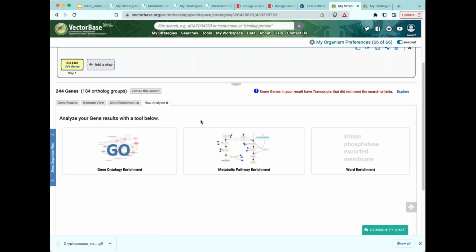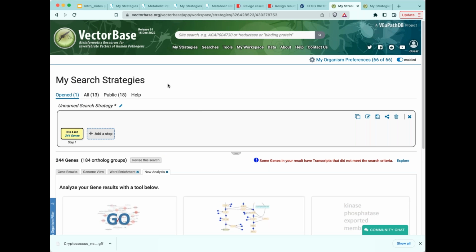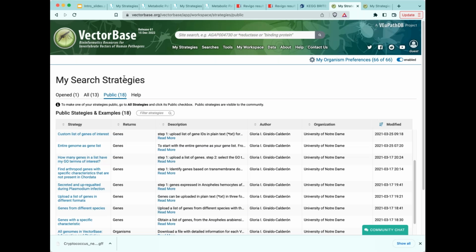Right. One more thing that I wanted to mention about this particular search. The search that I have just shown you was actually part of a public search strategy that was created by Gloria in the past. And we offer quite a few public searches for you to review in case you have common questions that people have asked in the past.